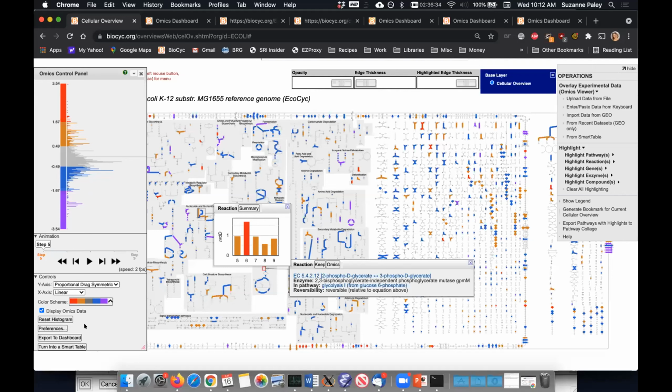Is this tool functional with LC-MS proteomics? Really, the tool should be functional with any data. The tool doesn't care about the underlying technology. It's just mapping the data value ranges that you provide to a color scale, so long as you provide identifiers that we can map to something that we know about. So with monoisotopic MS data, if you have monoisotopic masses, we can map those to compounds, or if you actually have IDs.